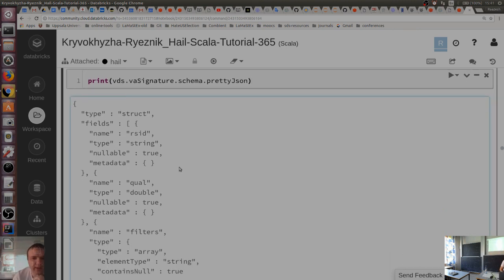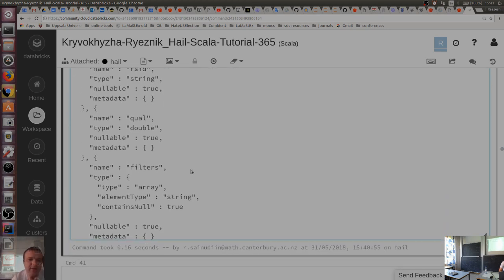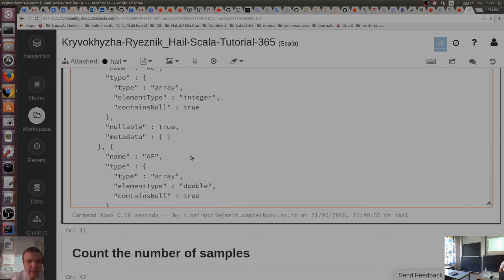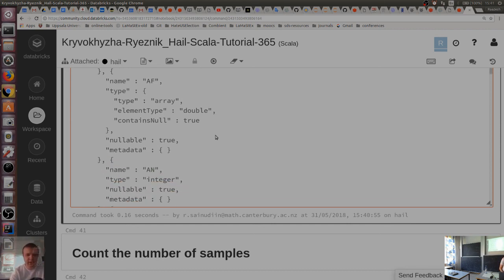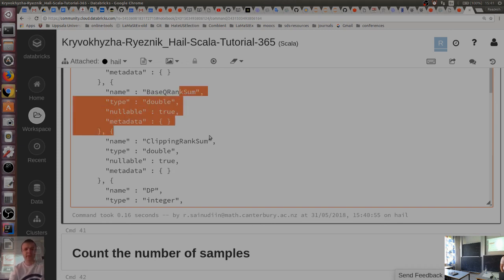So for example, here, if we have any filter applied, we can see it. For example, this is allele frequency. If we have one position, we can have the frequency, because we have two alleles, so one of them may be more frequent than the other, and we can get this information for every row. And a lot of other information, you will see it later when we do filtering by variants, we will use this information.